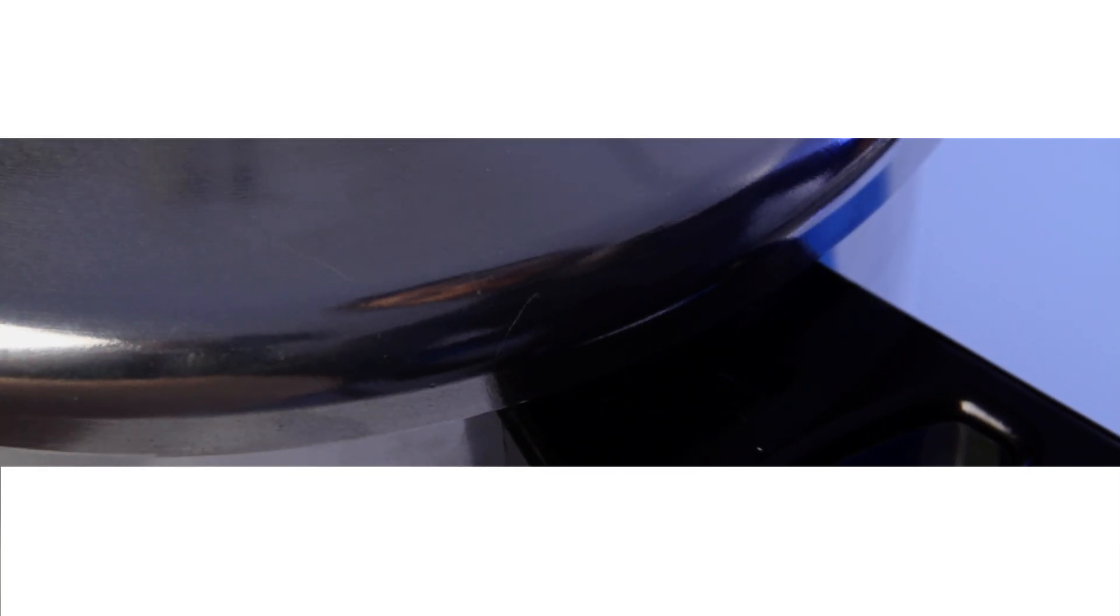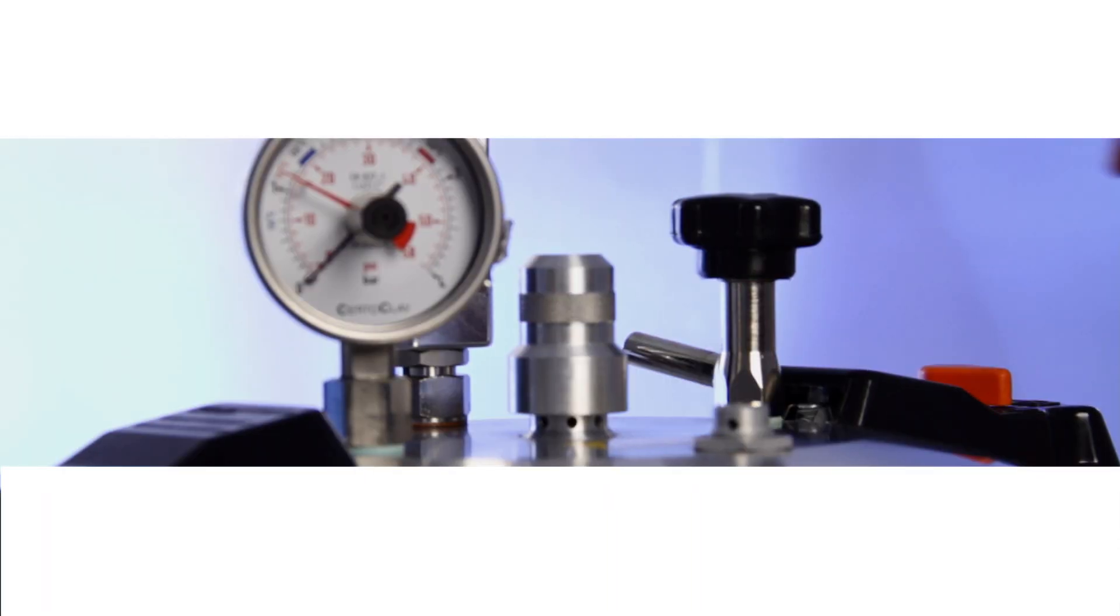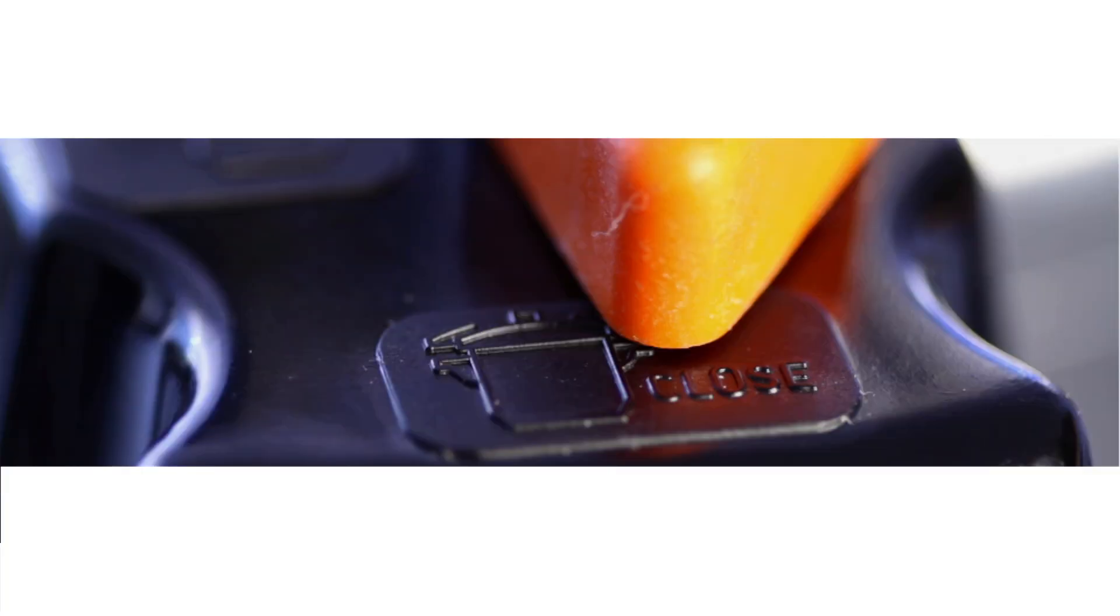Place the lid and secure it by gently sliding the Certolock shutter. Use the orange button to lock it. This ensures the kettle cannot be opened under pressure.